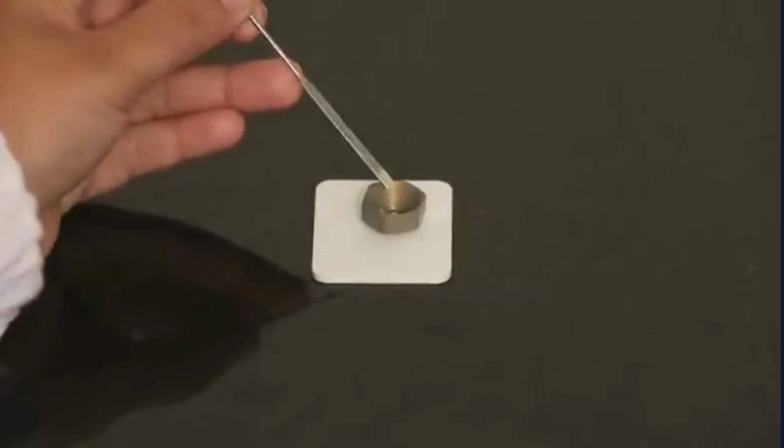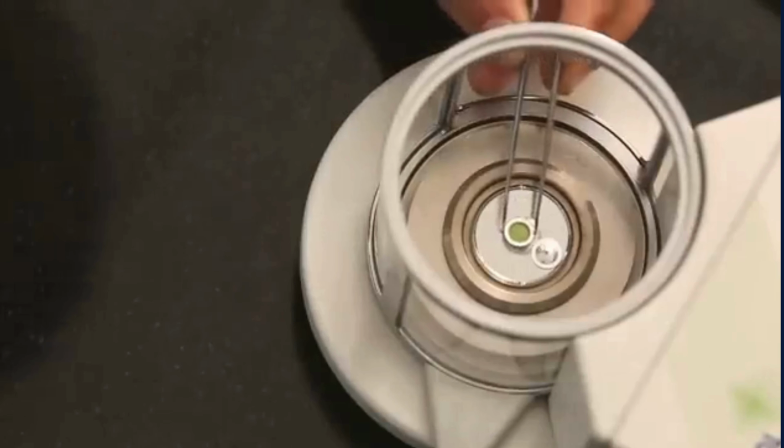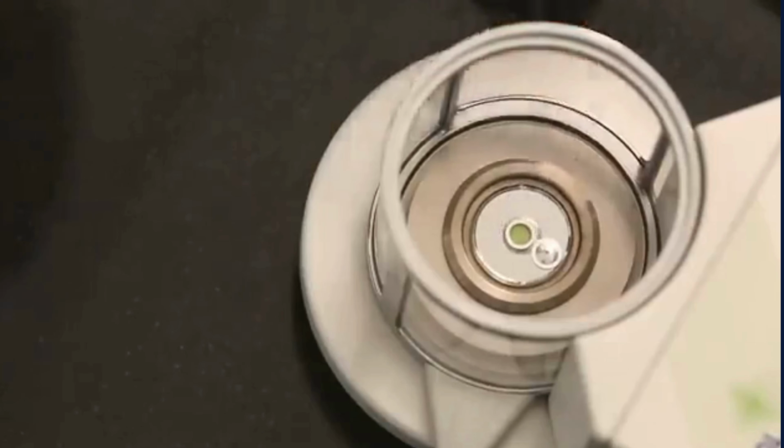Sample placement. The specimen should be centered within the pan to maximize thermal contact and minimize measurement errors. Purge gas selection. Nitrogen is most commonly used for polymers because it minimizes oxidative degradation. Helium may be used when improved heat transfer characteristics are desired.